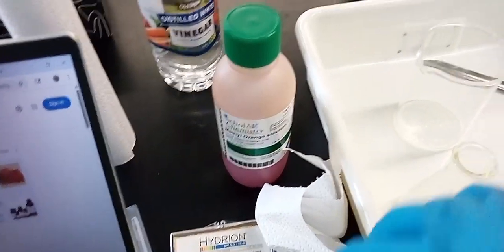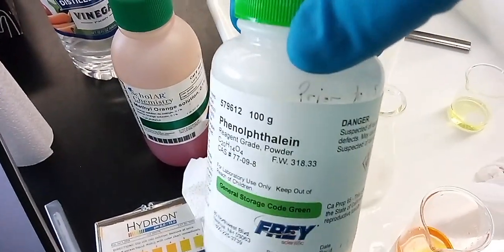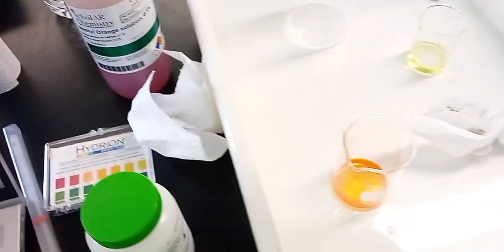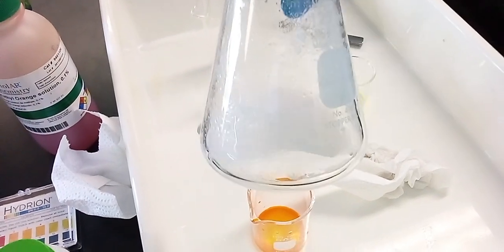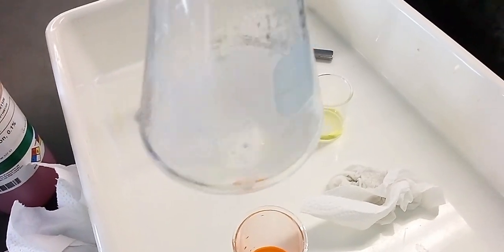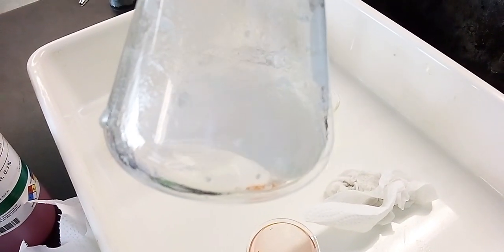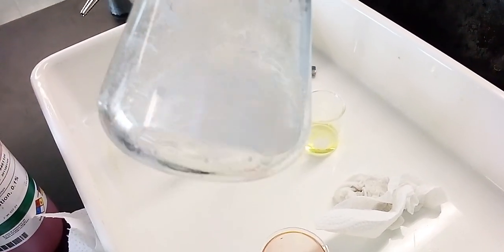Another of the indicators is phenolphthalein. This I used to have when I was younger. I used to play with this. I had a chemistry set and it had this. And this one I like because it turns pink. If you have an acid or something below pH 9, this will be clear, and you can see this is water. I just had to dissolve some phenolphthalein powder in here, and it's clear or kind of whitish, but it doesn't have any color at all. It means that the pH is less than 9.